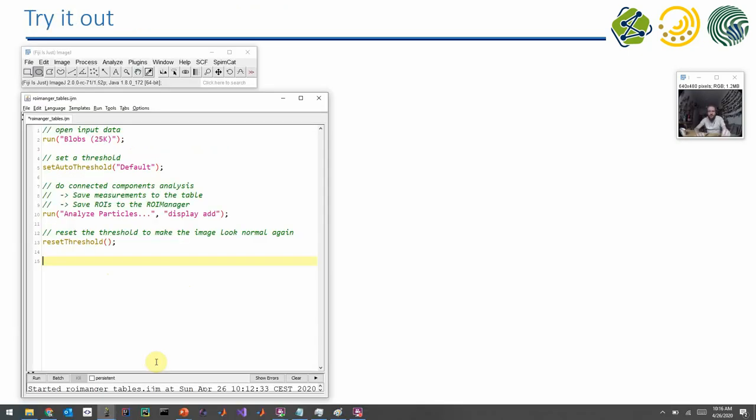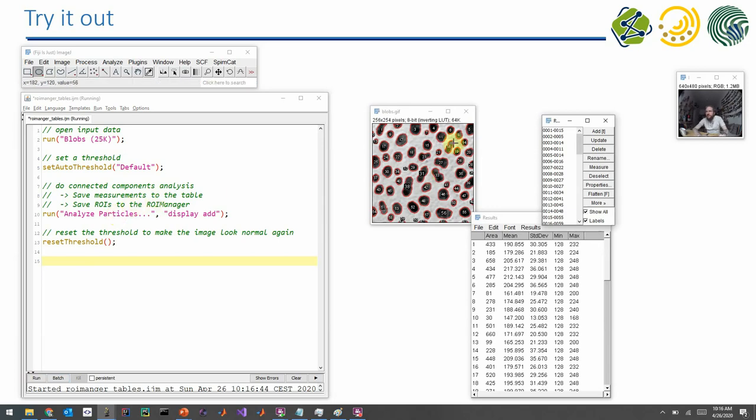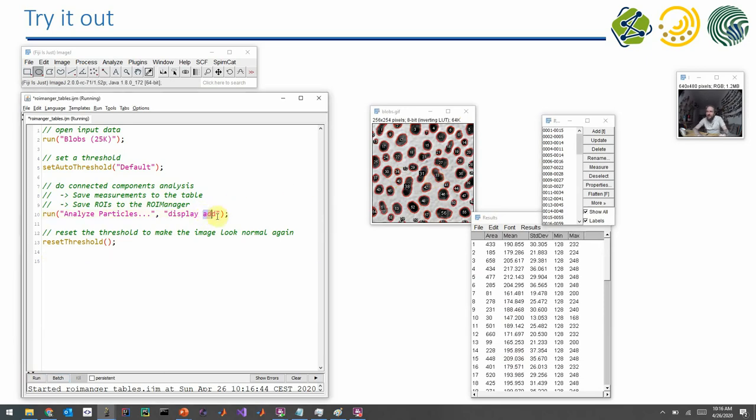All right, let's play a bit with tables, ROIs, the ROI manager, and basically all the important things together. I record a little program. So this is our starting point now. If I execute this program, it will open an image, it will do some thresholding. Also it calls the particle analyzer to do a differentiation of all the objects. It does some measurement, puts it in the table, and it adds the ROIs to the ROI manager. So this is kind of our starting point and this is something you did earlier.